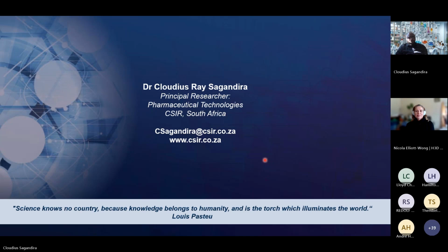Hi, Dr. Saga. Thank you so much for the great presentation. My question comes across like an economy type of question. You mentioned it a little bit, but can you modify simple reactors to do reactions for photochemistry or electrochemistry, or do you have to buy specific reactors for that specific type of reaction?